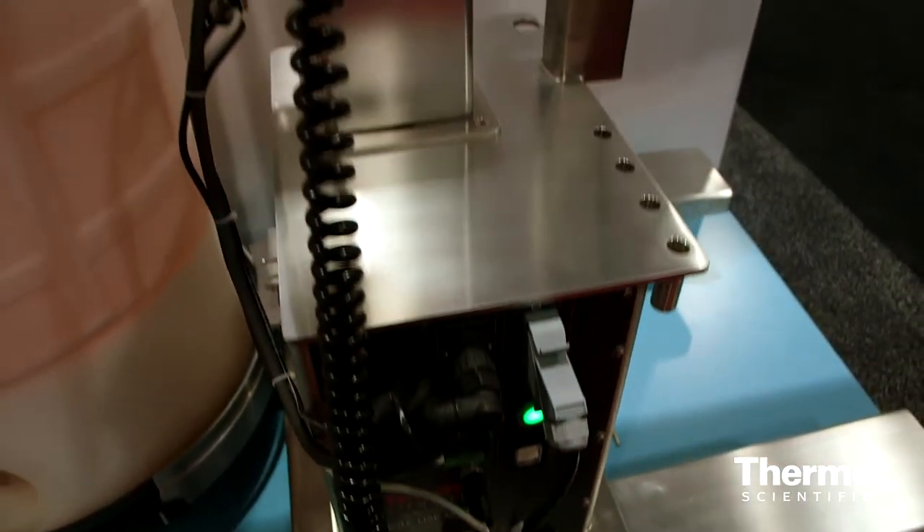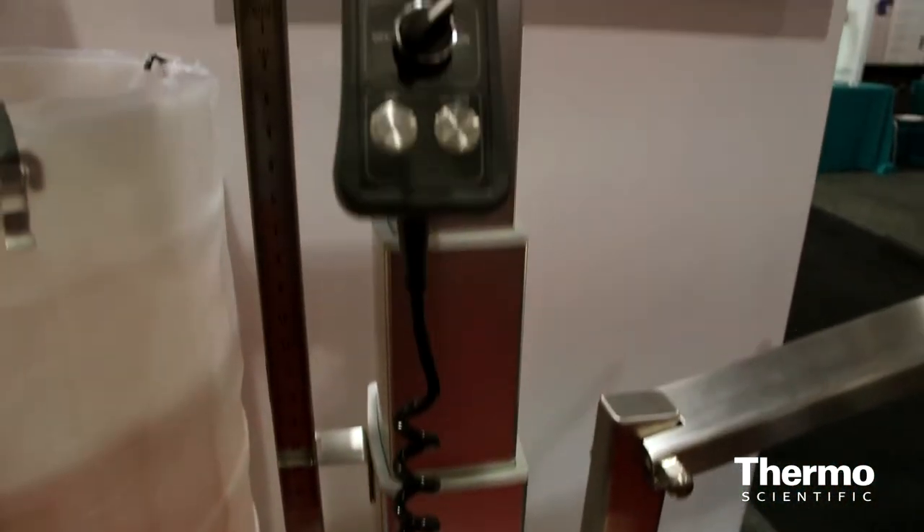This is a single-use mixer called the DS300. The DS stands for docking station. The stainless part is what we call the docking station. The motor can be lifted up and down.